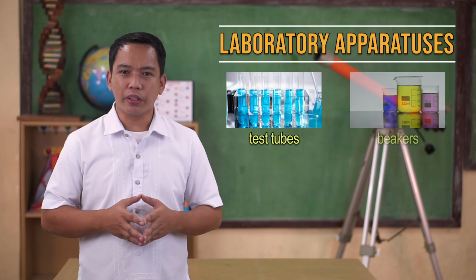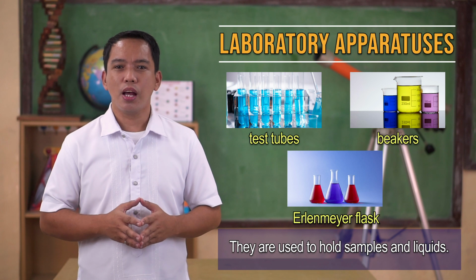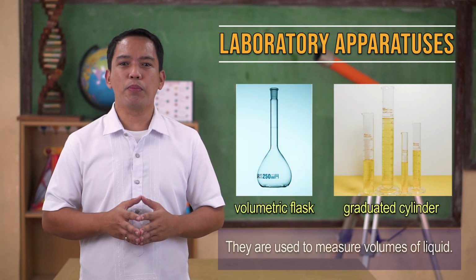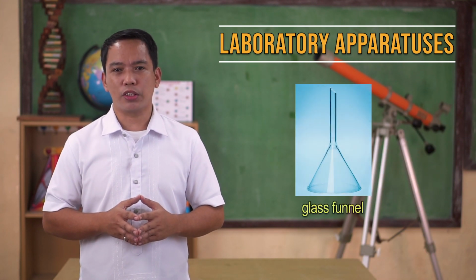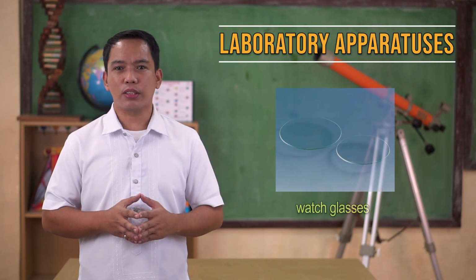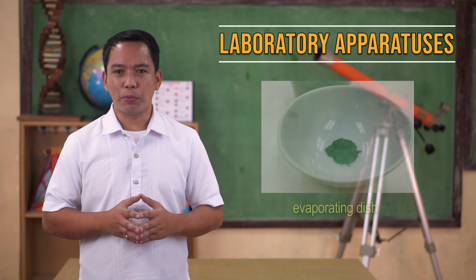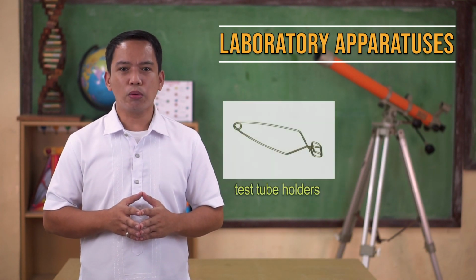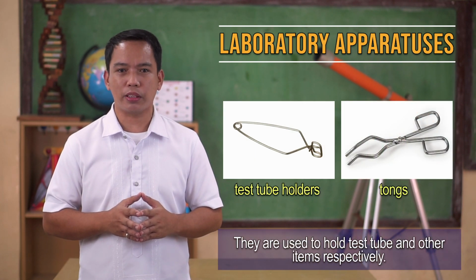Test tube, beaker, and Erlenmeyer flask are used to hold samples and liquids, while volumetric flask and graduated cylinder are used to measure volumes of liquid. Other glasswares include glass funnels which are used in transferring or filtering liquids, watch glass to hold small samples or cover other glasswares, and evaporating dish for evaporation of solutions. Test tube holders and tongs are used to hold test tubes and other items respectively.